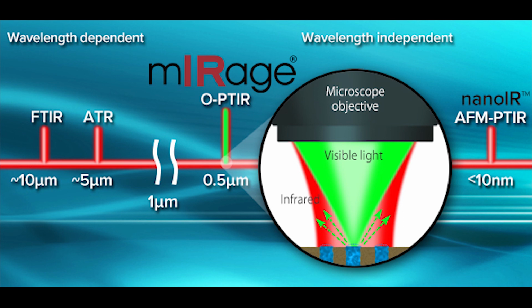There's a question about is there a sample holder that allows conditioning of the sample under specific gases? That's something that we don't have right at the moment, but we are interested. So feel free to talk to us about specific needs and applications that could help guide that effort in the future.